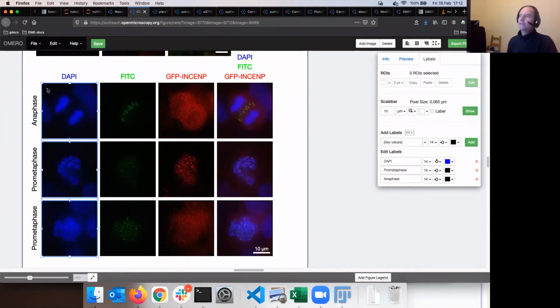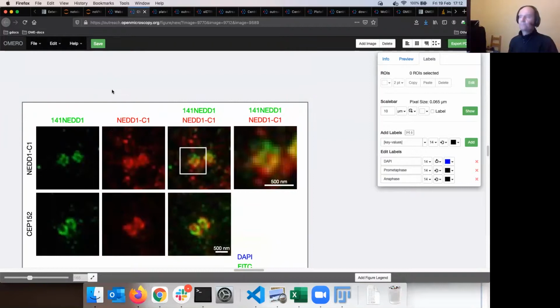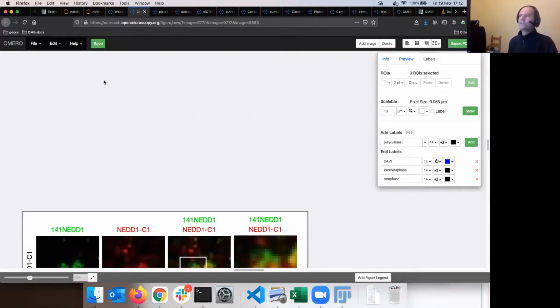And Peter, before, yes, now that you have the annotation, could you show again, Claire was asking, can you show again how you inserted the image the second time, where you selected your images from your rating, your 5-star images? How did you insert it in the existing figure? Perfect. So this is a usual question.